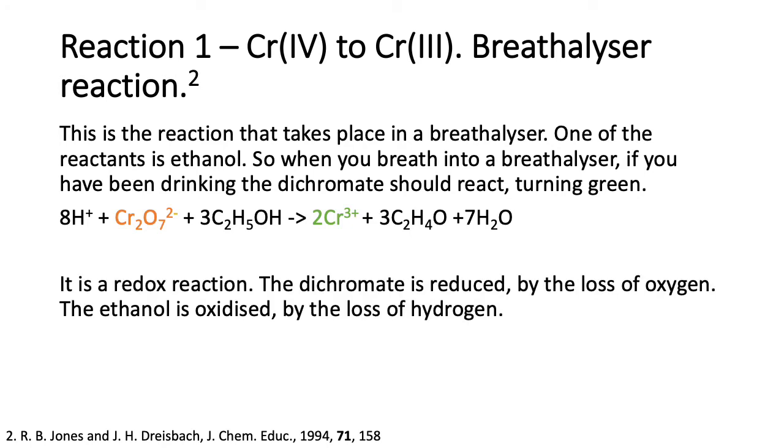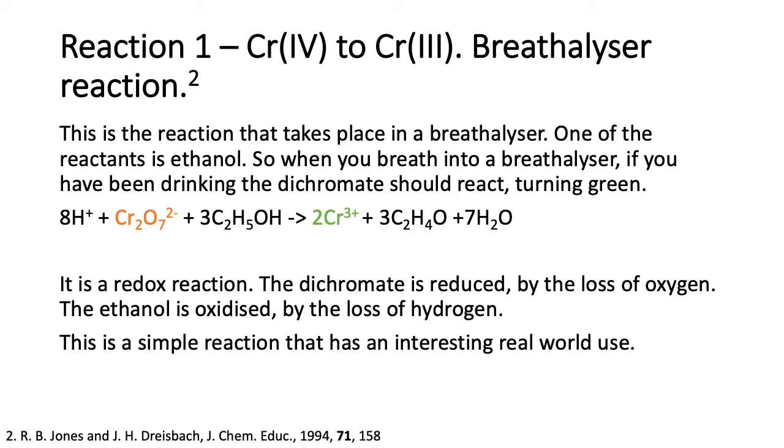As you can see, it's redox. The ethanol is obviously oxidized, and the chromium is reduced. And it's simple and has an interesting real-world use that I think students would like.